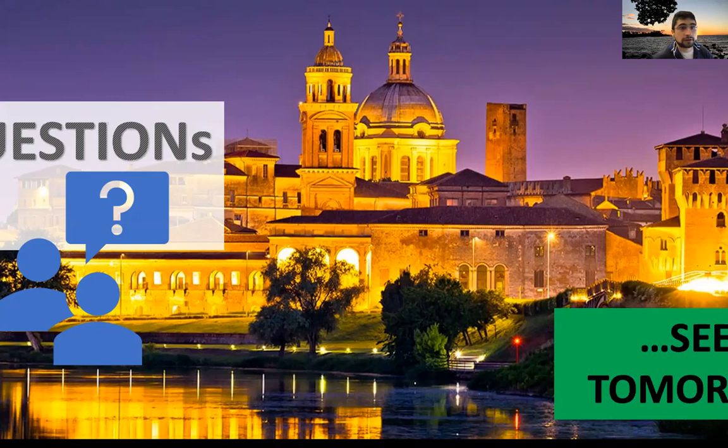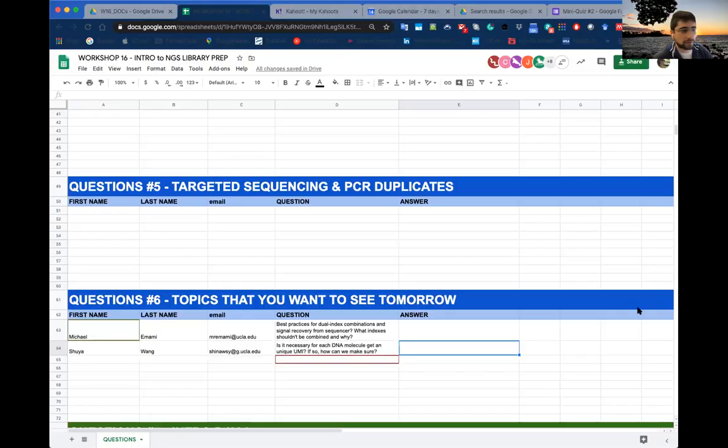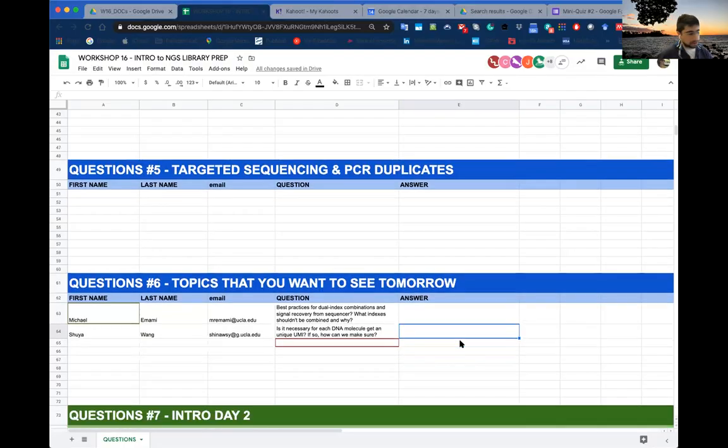Sorry, I forgot to share the screen so everybody can see the question. Is it necessary for each DNA molecule to get a unique UMI? If so, how can we make sure? The answer is yes and no. As I was telling you, the most common design is the random. And so you might have the design with biases. The random that is usually synthesized in the oligos is not true random, so you have biases there already. Like few sequences might be overrepresented.